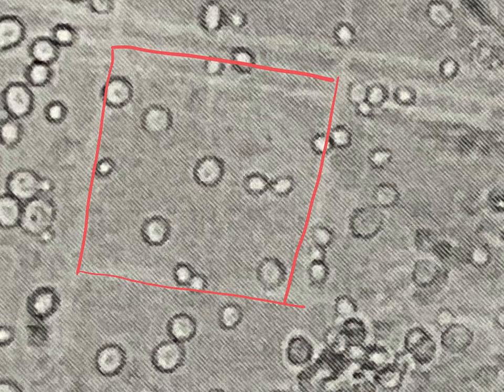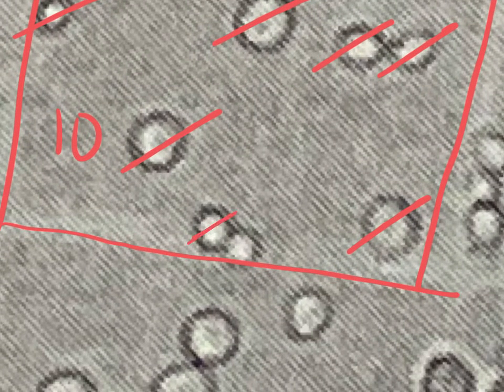So if I was counting, that would be 1, 2, 3, 4, 5, totally 6, totally inside. Count the ones at the top. So that was 6, then 1, 2, 3, 4, 5, 6, 7, 8, and on the left, 9, 10. Oh, one more. I think I would count that one, but not the one at the bottom there. So it'd actually be 11 then.